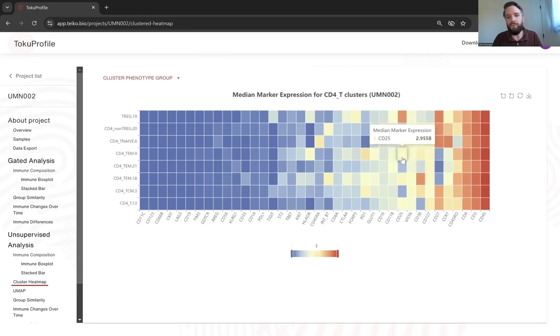And these can be some of the most interesting ones to follow up on with statistical analysis, because if these unique clusters are associated with a certain functional status of these cells, that might indicate something that's associated with response or time point, or if your study features different dosage levels, that might be something to follow up on as an interesting biological mechanism.